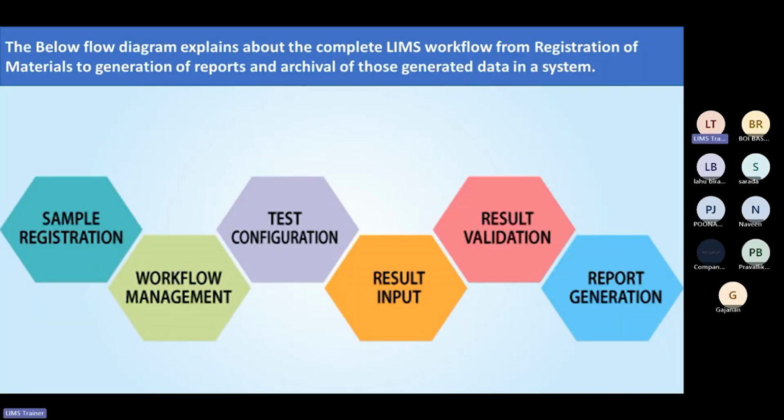Then see the workflow, the material workflow: sample registration, then the workflow of that particular sample, then test configuration, result input, result validation, report generation. All these activities I'm going to explain in further lectures, how this workflow happens, in the sessions. Then see, this is the basic workflow.